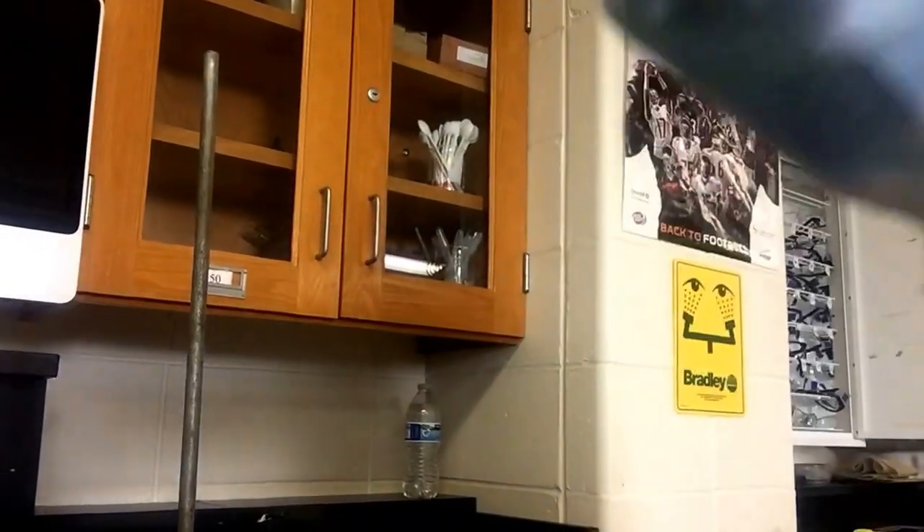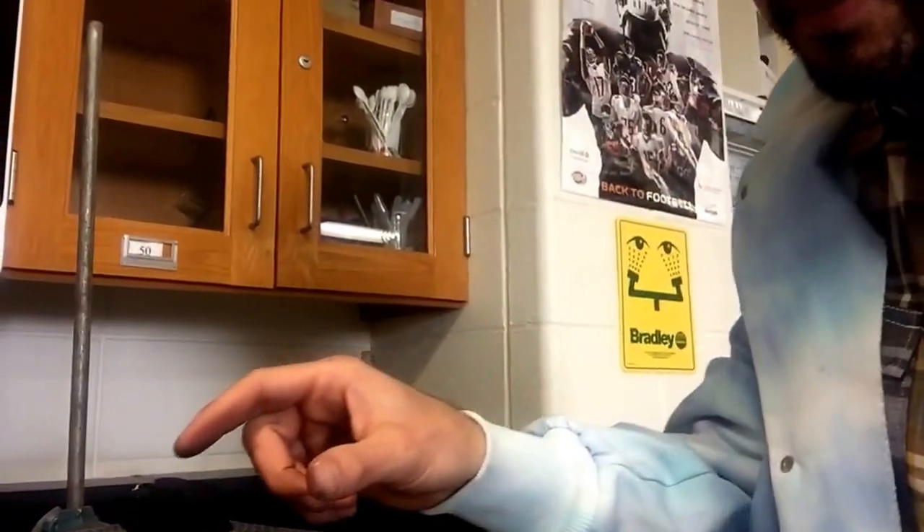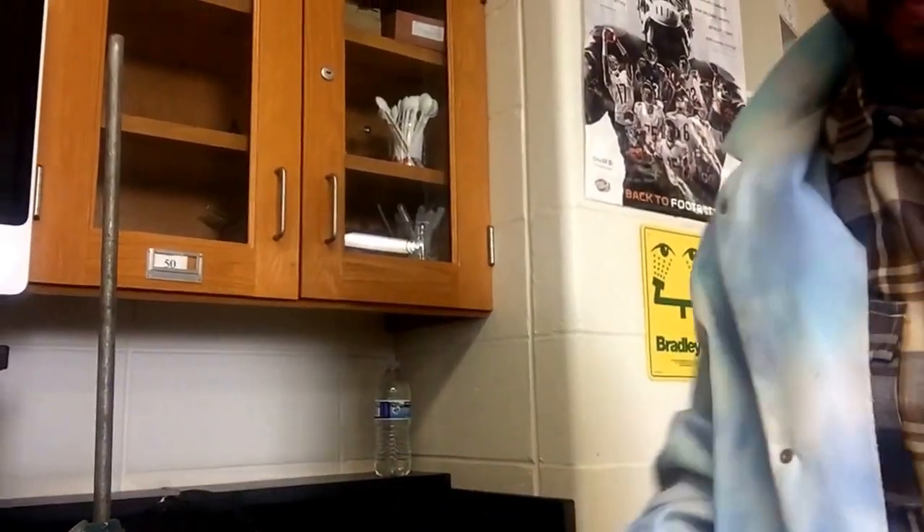I'm going to readjust the height of the ring stand so you can see what I'm talking about. All right, so here's my little piece of charcoal.